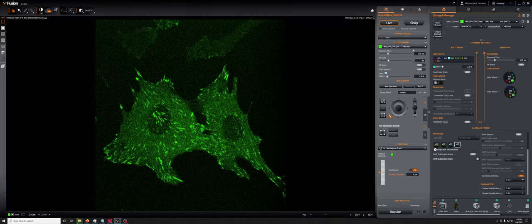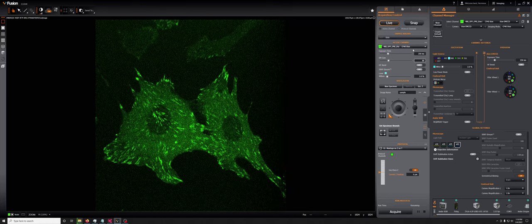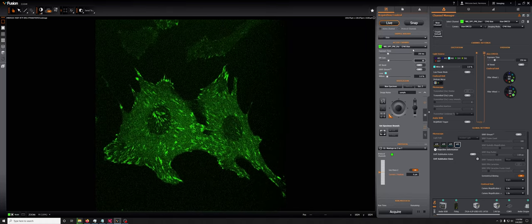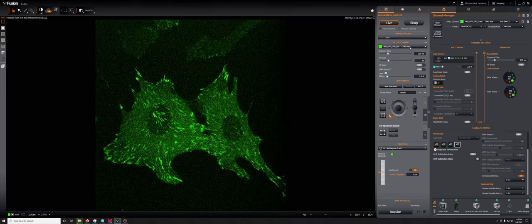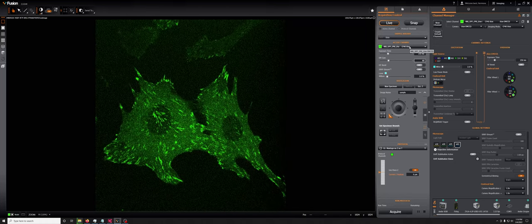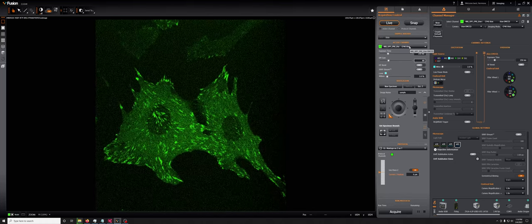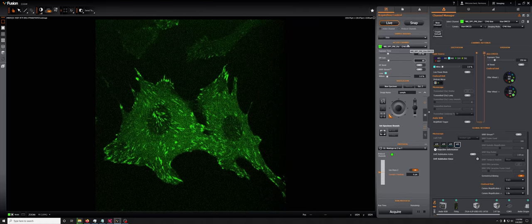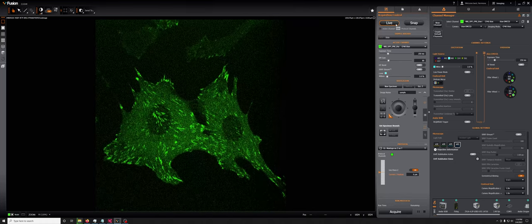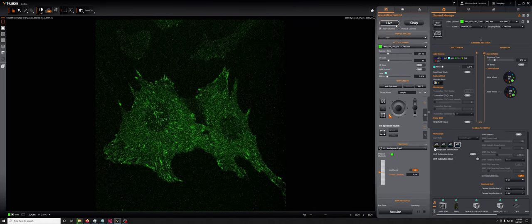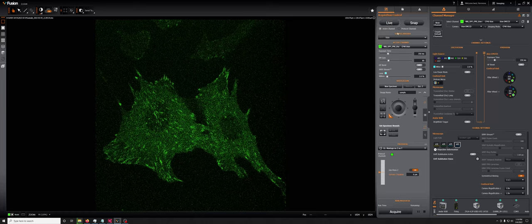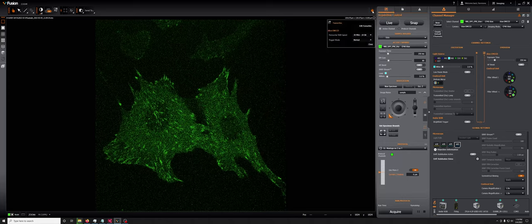There is one other commonly used parameter in the EMCCD, or rather I should say it's a parameter you can use, maybe it's not so common. And that one lives here under this star feature, and it's the horizontal shift speed.